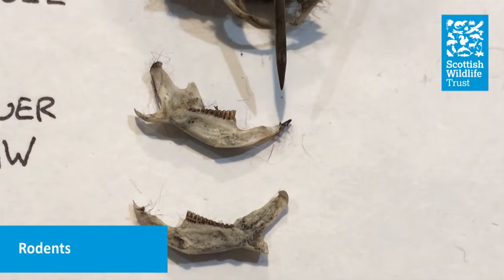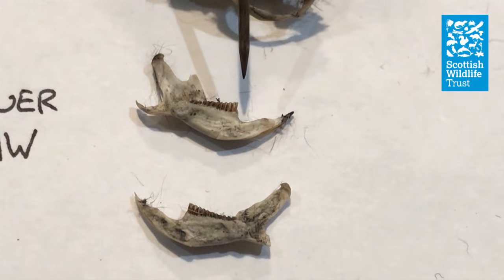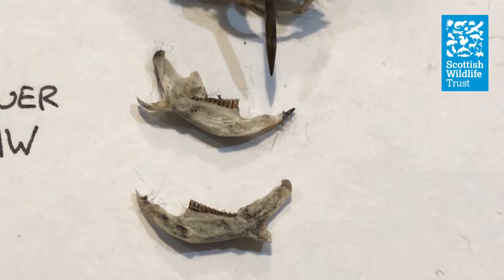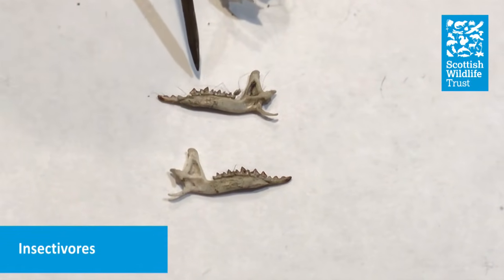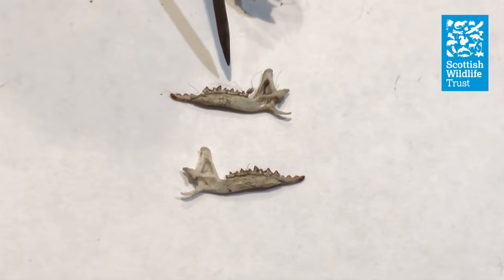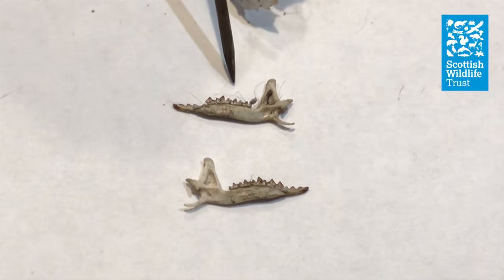Voles and mice are both rodents, meaning that they gnaw their food, so they have quite similar jaws. As you can see, there's a big gap between the long front tooth and the teeth further back in the mouth. Shrews, on the other hand, are insectivores and they chew their food, so they have quite different teeth. As you can see, there's no gap between the front and the back teeth, so if you see this, it's quite likely that you're looking at a shrew.